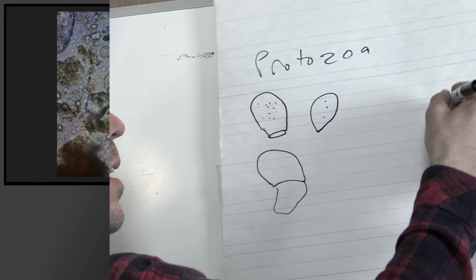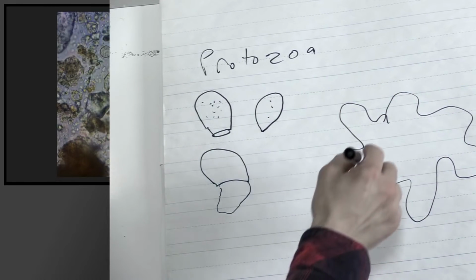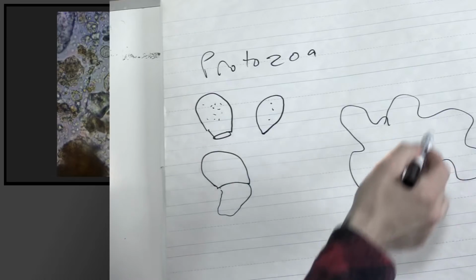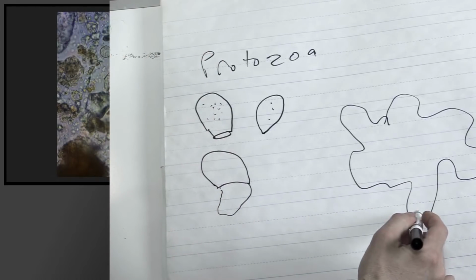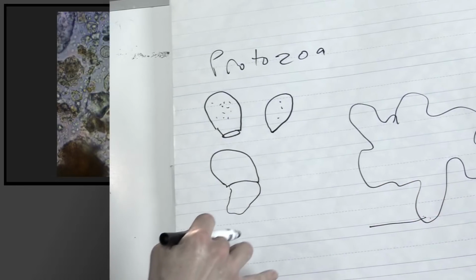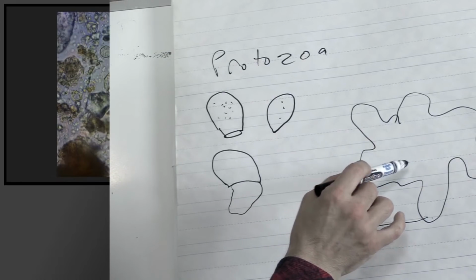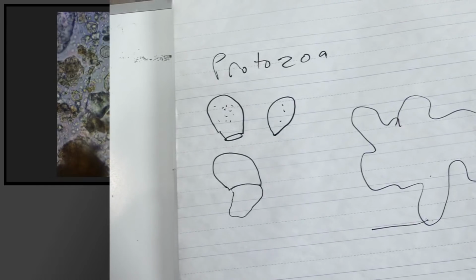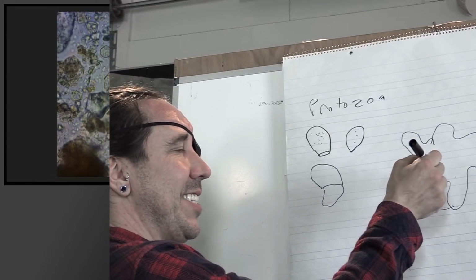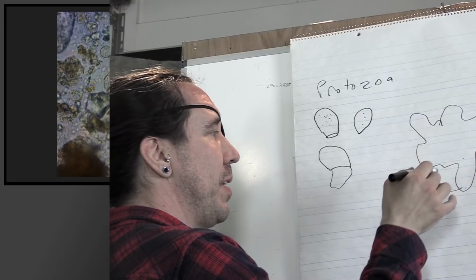We've also got naked amoeba. Naked amoeba can be basically any shape. They look like a blob from the movie The Blob. And they use a pseudopod. One of these parts is going to be their pseudopod or arm that they reach out and grab hold and pull themselves across the surface. When you're searching through the microscope, the naked amoeba can be very hard to spot. They look like a little slime spot, like snot basically, on the slide. It looks just like an out of focus section a lot of the times, and you might easily glance over them and totally miss them.